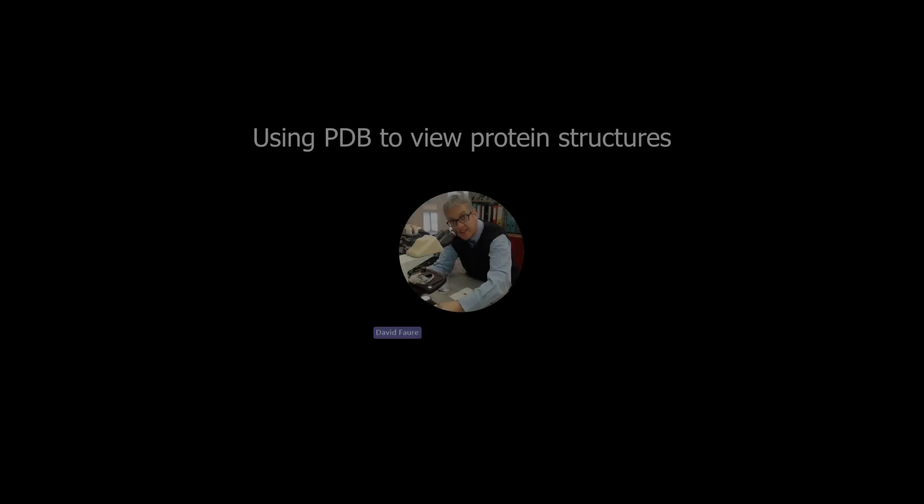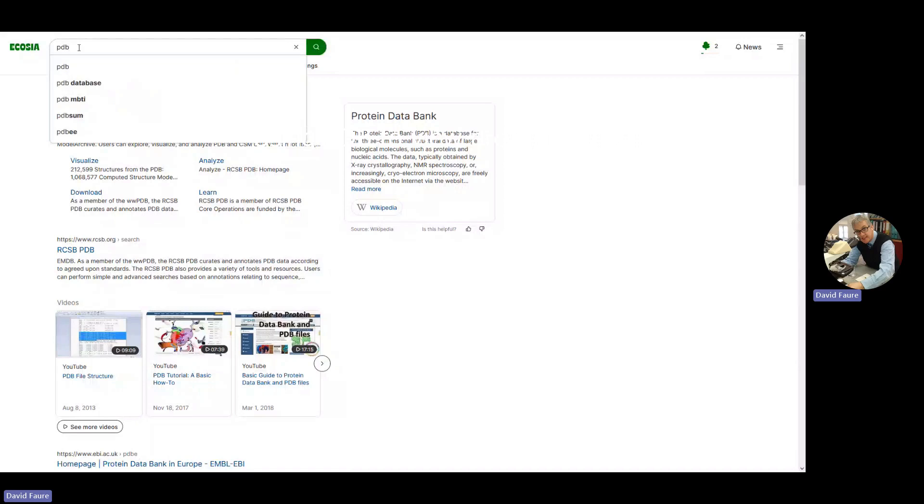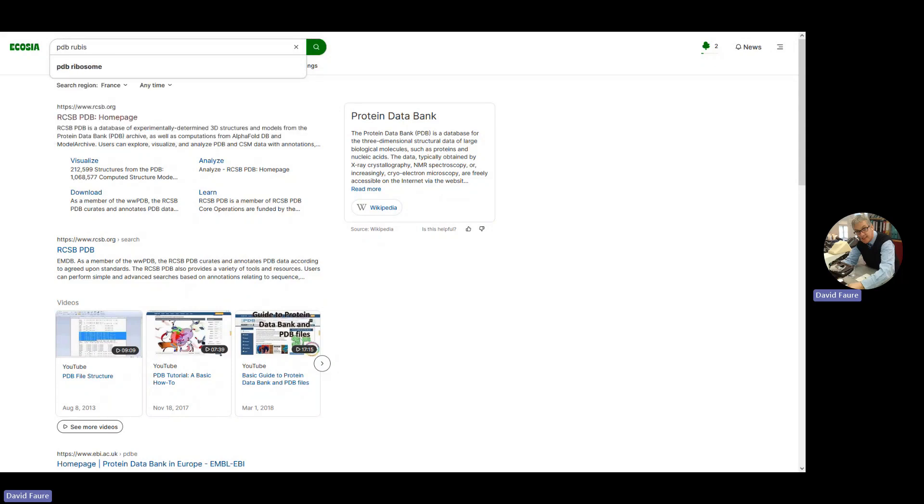This is a little explanation on how to look at proteins using the Protein Data Bank. The first way is to start with your browser search engine. Let's type in PDB and the name of one of the proteins we want to look at. Let's try Rubisco.